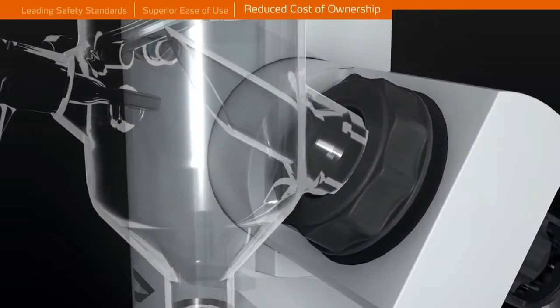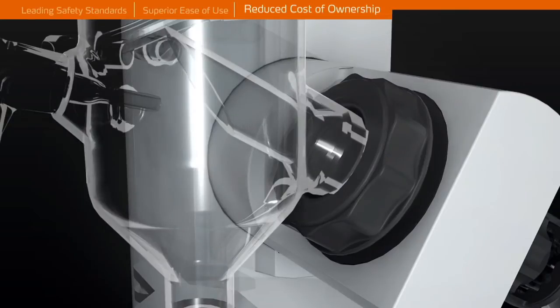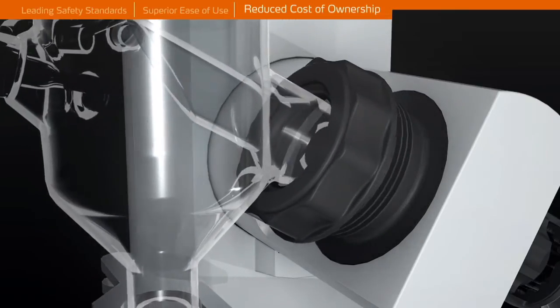The sealed drive prevents corrosion, and the PPS flange is of higher chemical resistance than stainless steel to ensure corrosion is minimised.